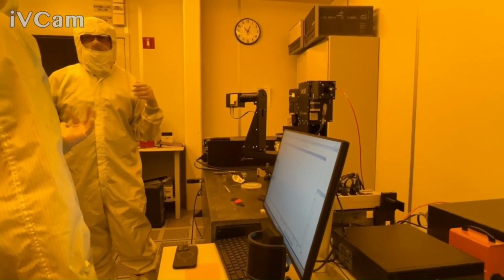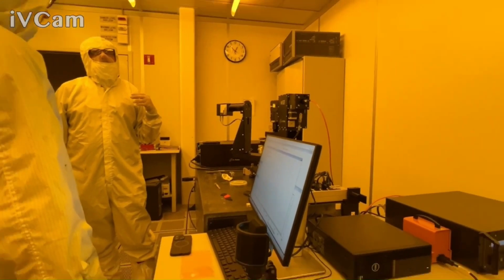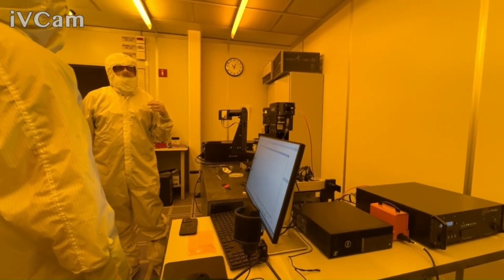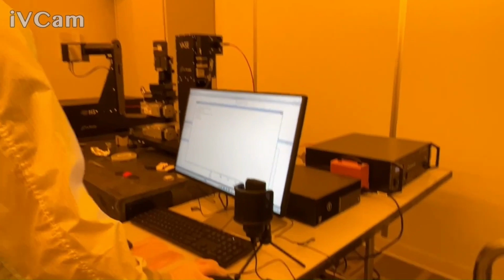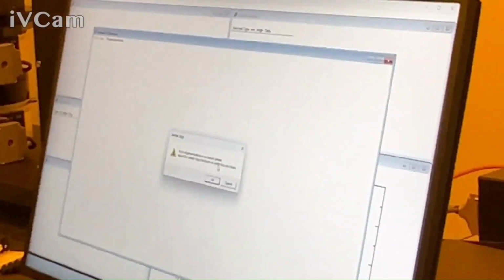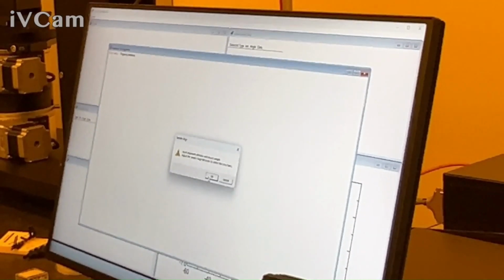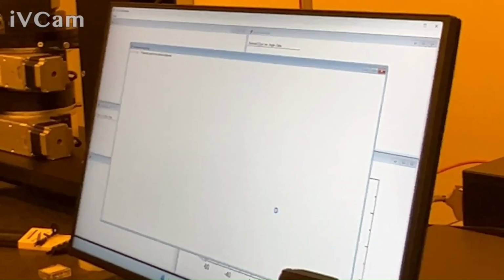Well, we can't throw the spacer in? Can I do that at 9? Yeah, I can try that. Let's try that. So let's align your sample first since it's already there. Again, that works well for transmission. I might be able to trick it for reflection baseline, but we'll have to give it a go and see if that works or not.